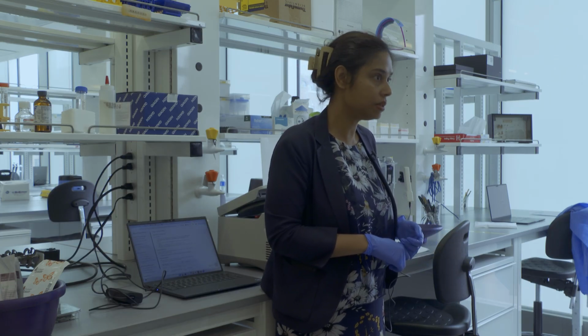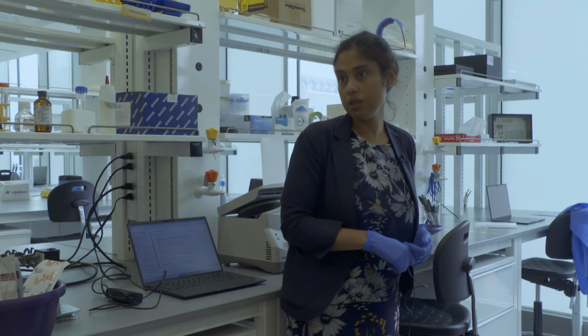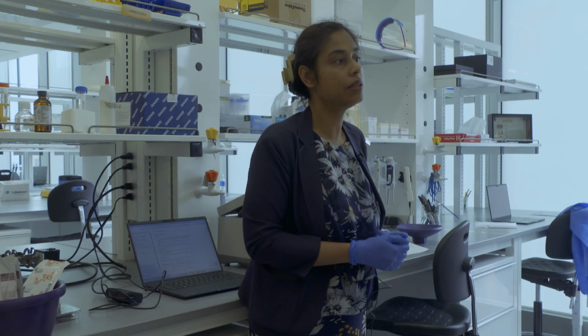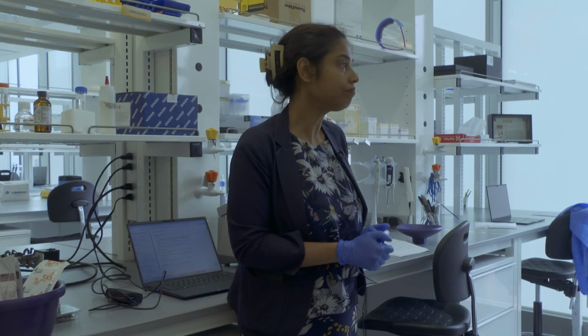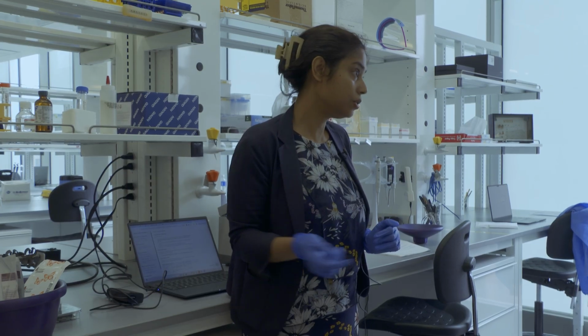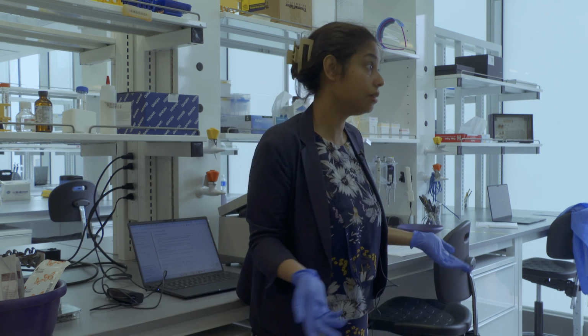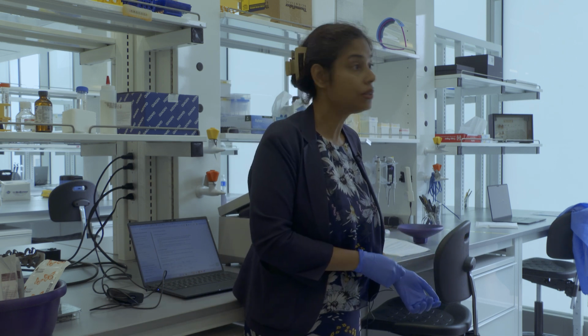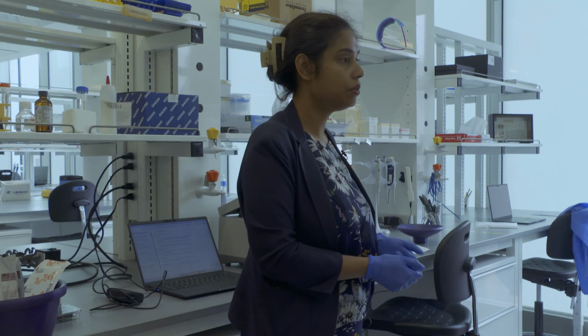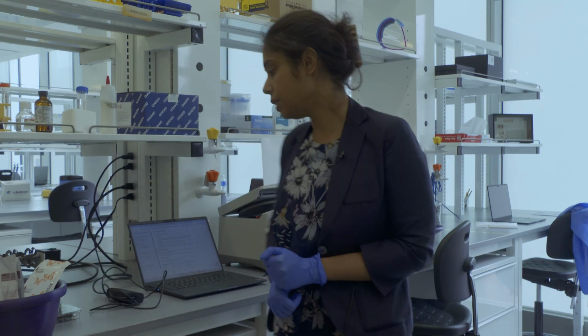That is always possible, and sometimes it is a good strategy, especially when we are optimizing something with a unique sample like yours. It's good to run in HAC mode and then rebase call in SUP to see if there is any difference. So this is something I thought of mentioning; for P2 Solo, we'll see which way we can do the base calling and the sequencing run.